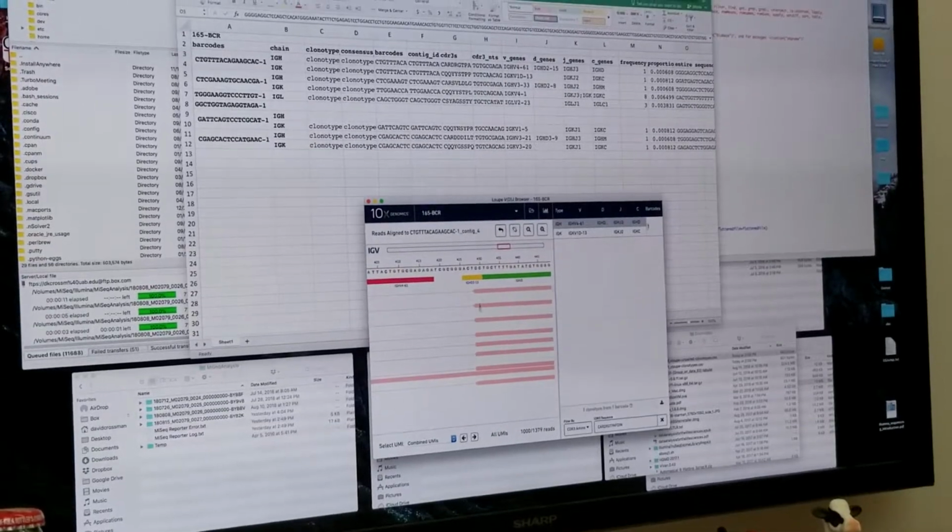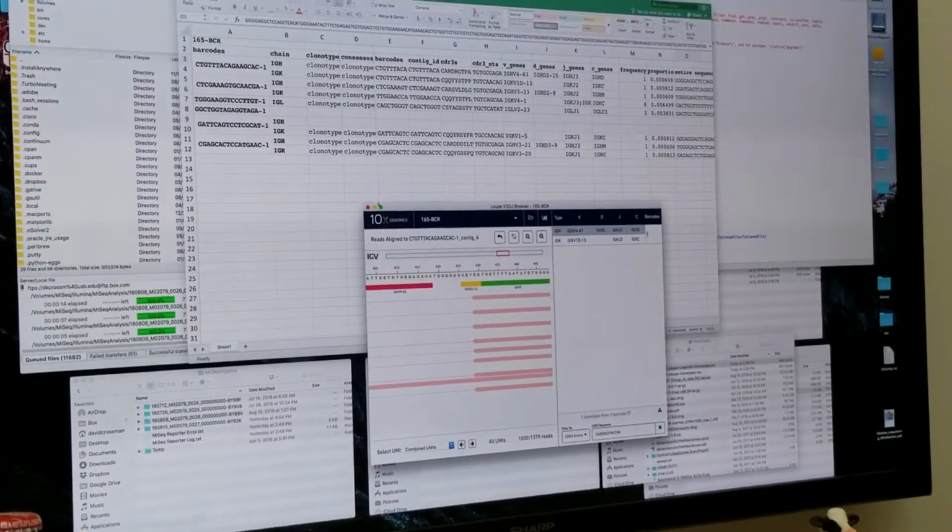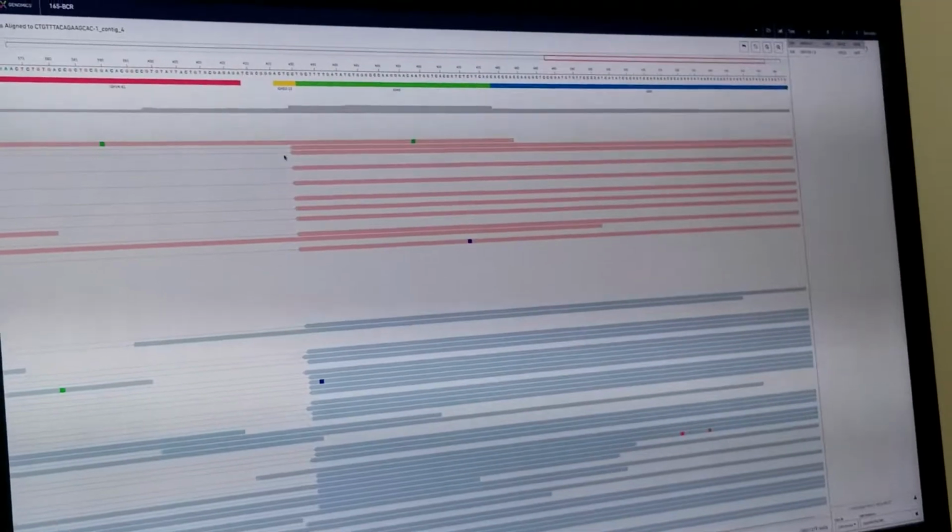Let's see here. I'm going to make this big. Did it call a D region? Did it say it's D something or other? Mm-hmm, it did. I'll show you where that's at.